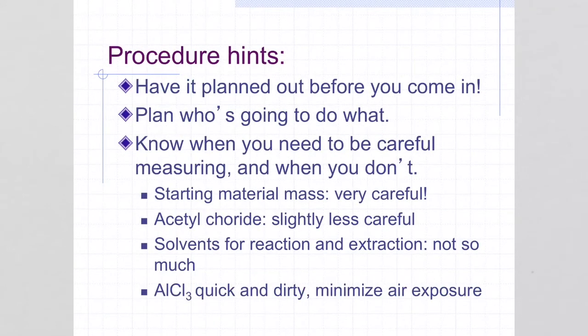Okay, before I take you through the procedure, just some hints to make sure that you are able to do this process efficiently. First off, really take some time to read the handout so that you have everything you're going to do planned out before you come in. It can be very helpful for you to talk with your lab partner and plan who's going to do what, who's going to do the setup, who's going to weigh things out, all that kind of stuff.